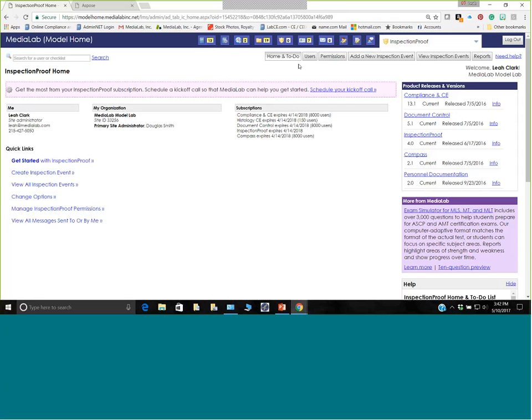And I'm also going to show you a completed event that I've been prepping just to give you an idea about what the end goal is, what it will look like once you have your checklist complete and you have all of your evidence of compliance ready to roll.